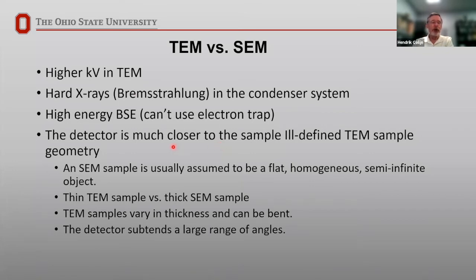Many of the detectors here are like 50, 55 millimeters away from the sample, whereas the detectors in our TEMs are on the order of 5 millimeters away. Also, we now have an ill-defined geometry. In the SEM world, a sample is assumed for quantification purposes to be flat, homogeneous, and semi-infinite, basically a very thick sample. If you're looking at something other than that, then be very careful with your analysis.